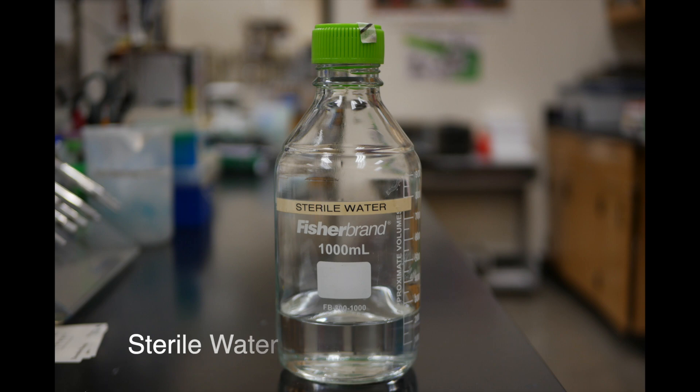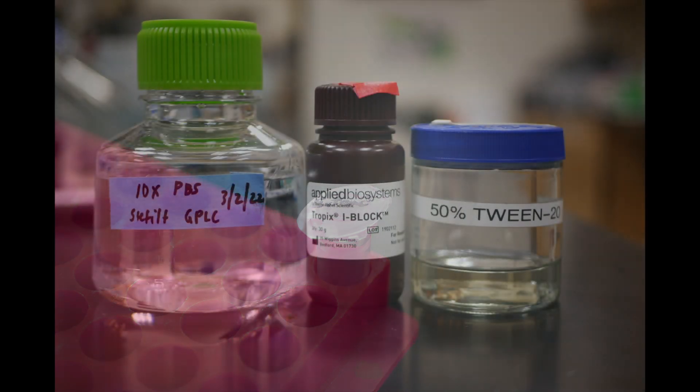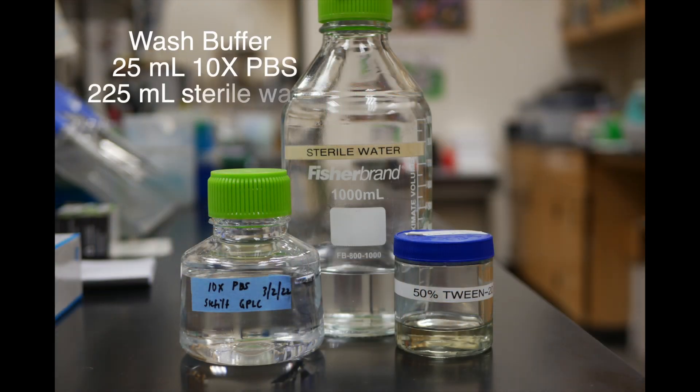We will also need sterile water and a protein extract or secreted media that our proteins are contained in. We will also need an iBlock solution made of 0.1 grams of iBlock, 50 milliliters of 1x PBS, and 100 microliters of 50% Tween 20. We will need a wash buffer made of 25 milliliters of 10x PBS, 225 milliliters of sterile water, and 500 microliters of 50% Tween 20.